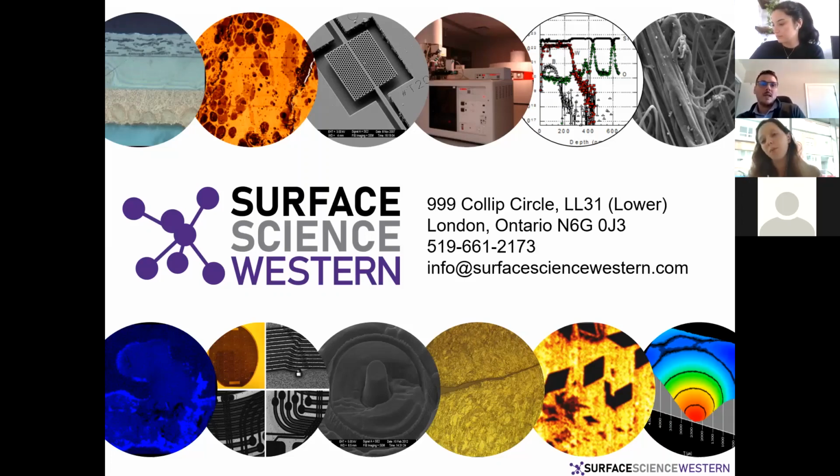For etching or depth profiling, the new gas cluster ion sources are quite a revelation. They really do allow you to do depth profiling while maintaining the chemistry of your material as you go into it. I've seen it work for oxides, and I've seen it work nicely for polymers. It really is a revolution, these new gas cluster ion sources compared to the old monatomic sources, which were great.